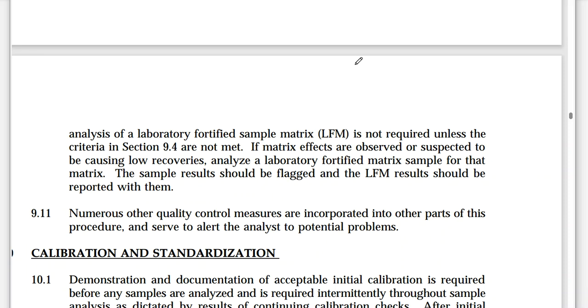So it helps me predict some of the problems that might happen with equipment later on down the future. When is something going off? When is something messing up? So that way we can catch these problems and fix them before that time actually arrives.